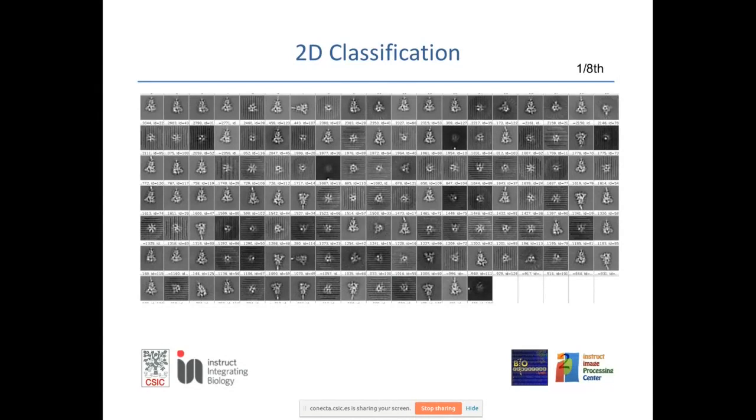And actually, in principle, there is no a priori knowledge that it has to find a particle that is round in the middle. So it finds images with similar patterns. And this pattern of the aperture was there. And it was in actually 7/8 of the data set. So only 1/8 of the data set didn't have this aperture on top.